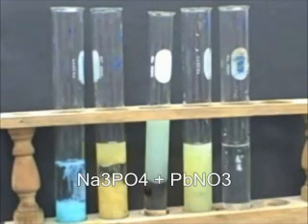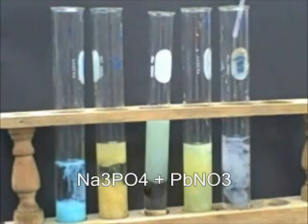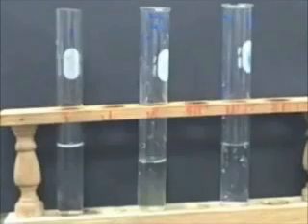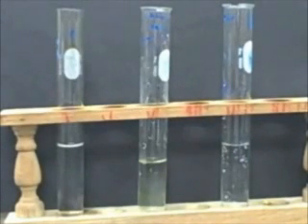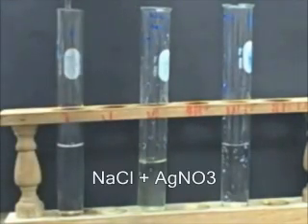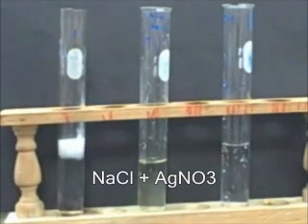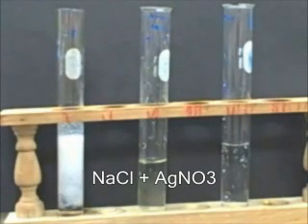In our last vial here we add lead nitrate. Lead nitrate is soluble, but when the lead mixes with the phosphate, lead phosphate precipitates out. Now we have 3 vials here. The first one and the third one are sodium chloride solutions, just salt water, and the middle one is potassium iodide. We're looking at the exceptions for the halides. Generally, halides are soluble except for chloride when it's mixed with silver nitrate.